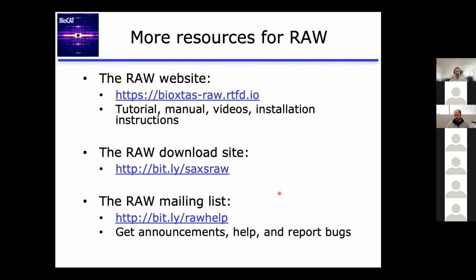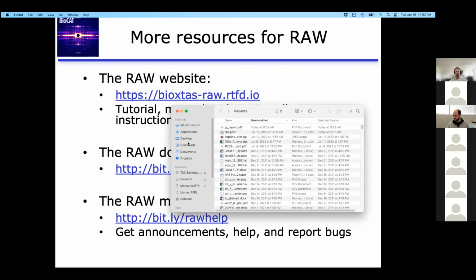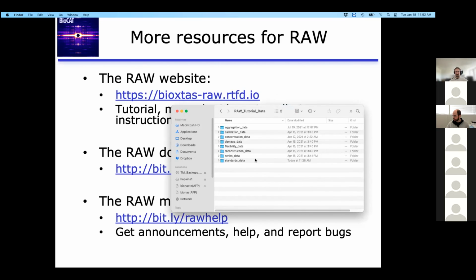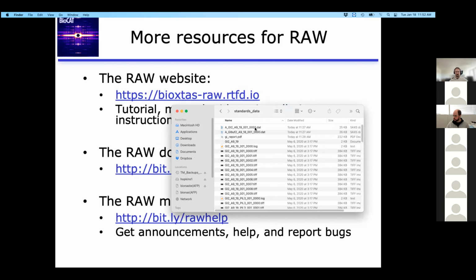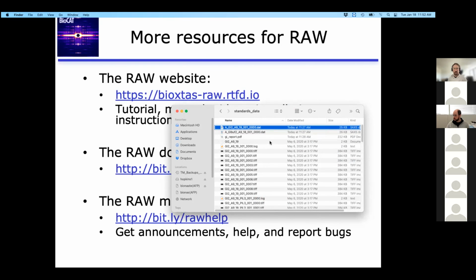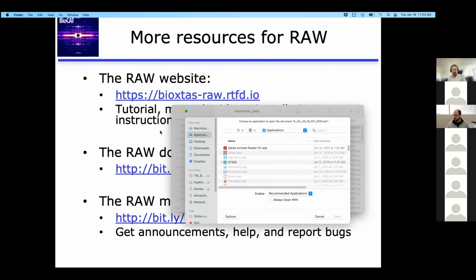Yeah, sure. So all the individual scattering profiles that we save, let me revert back to my data set here. So all the DAT files that we're saving, for example, this, are just saved as text files. So let me open this in a text editor here.